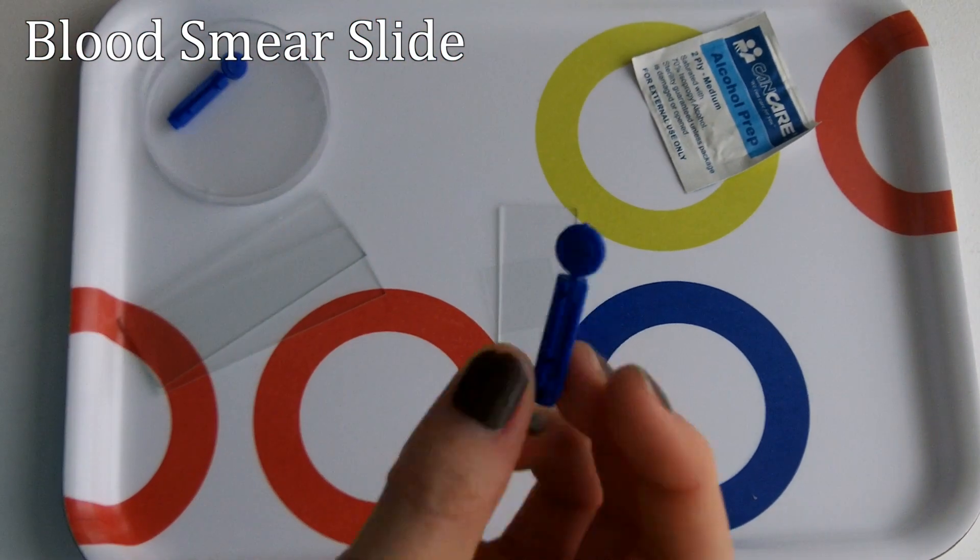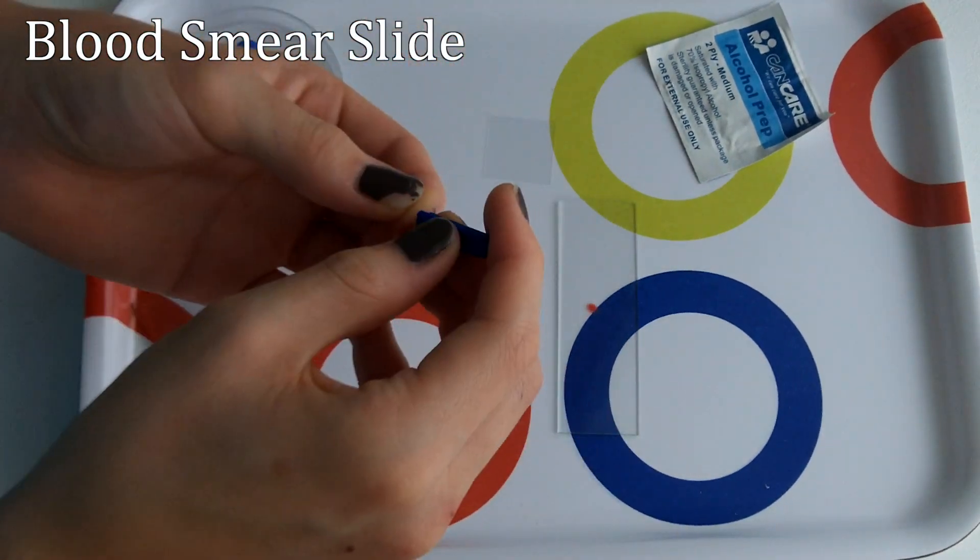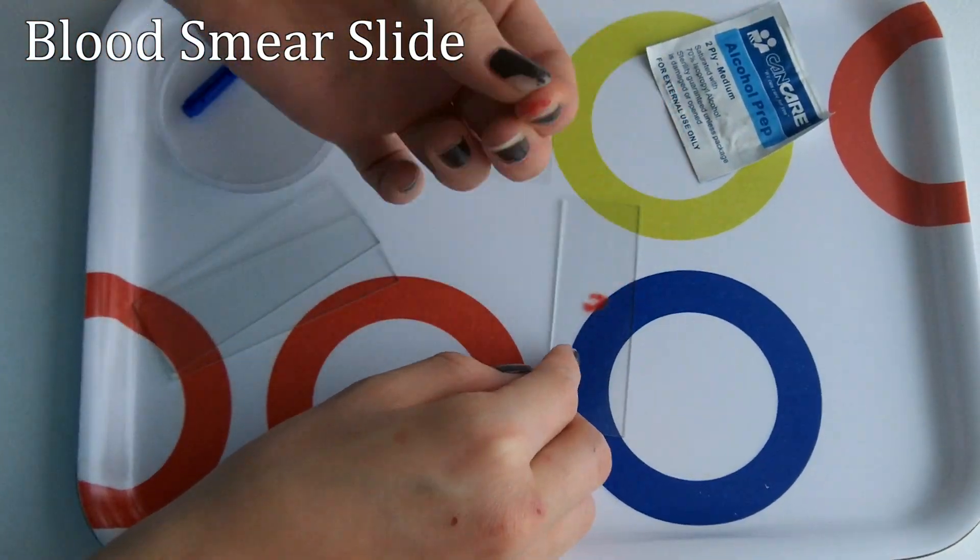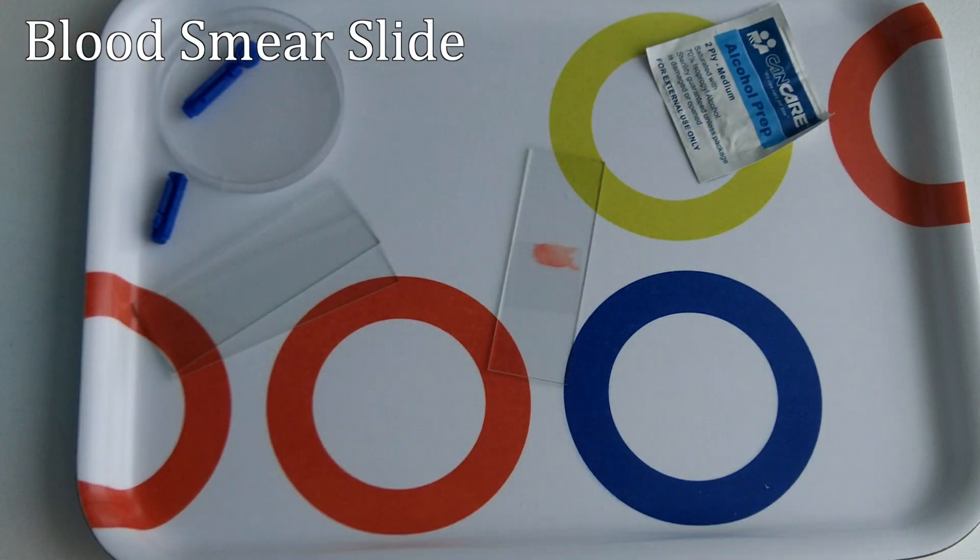To prepare the blood smear slide, use a lancet to draw blood from your fingertip. Place the blood into the center of the clean slide. Then, place a cover slip along the edge of the blood and drop it down to create a blood smear.